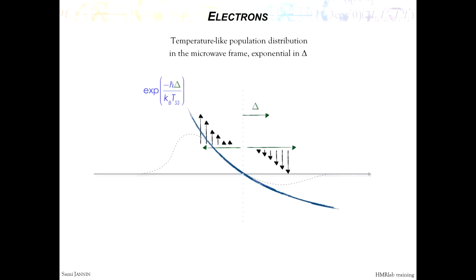And what this paper describes is totally counterintuitive, and I don't really understand the theory behind it. But what it says is that if you have a very fast spectral diffusion and you shine microwave somewhere, you will not saturate the whole line.